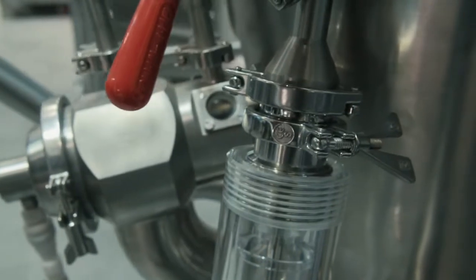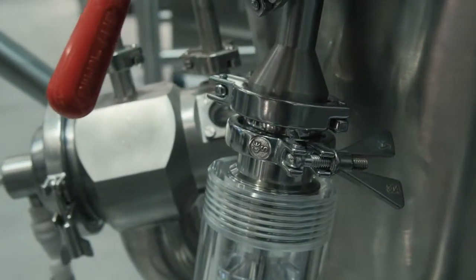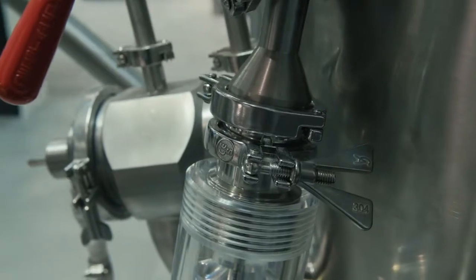It also offers the capability of carrying out spray granulation through our top spray system and Flexstream granulation through our Flexstream system.